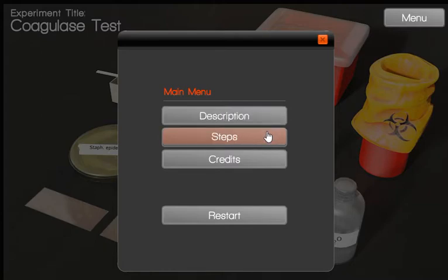Next we can read about the steps, how to prepare this reaction, credits about the authors of this program, and we can start or restart.